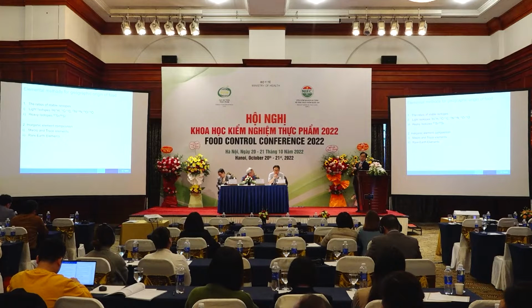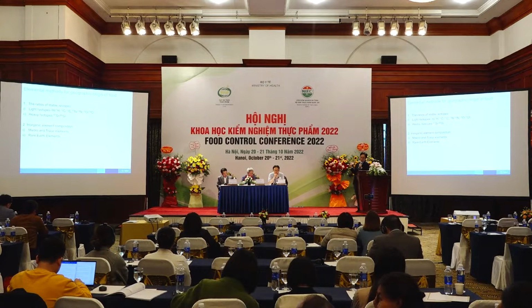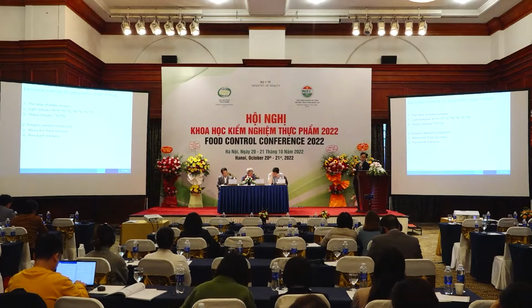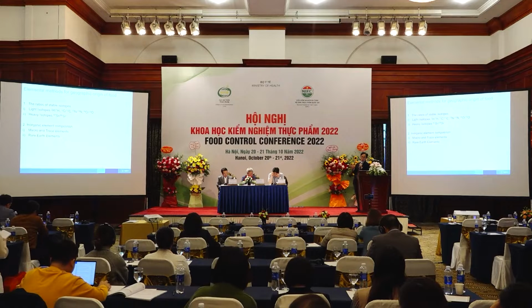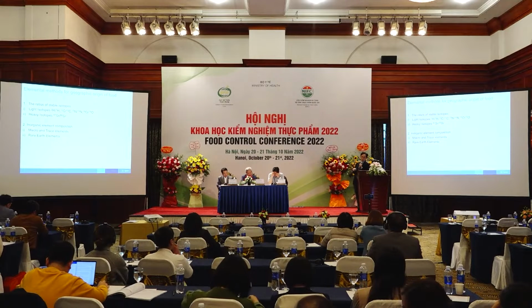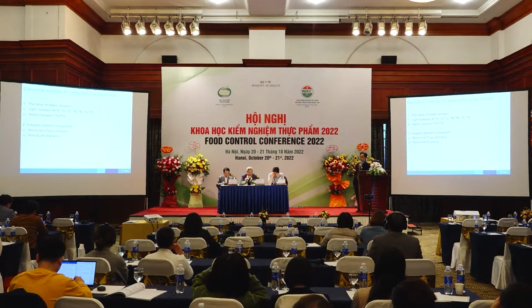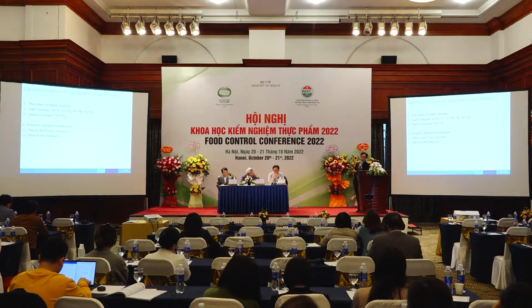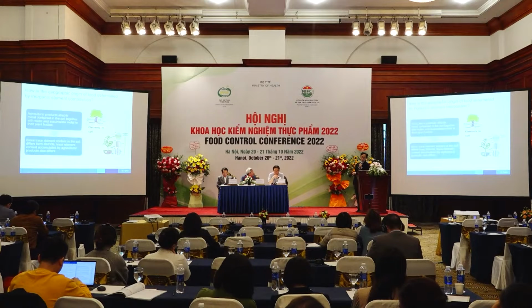We can also use rare earth elements. There are studies where certain farmers are using fertilizers enriched with rare earths, which has been shown to make the crops grow faster. But for this presentation, I'm more interested in the macro and trace elements for determining food origins.